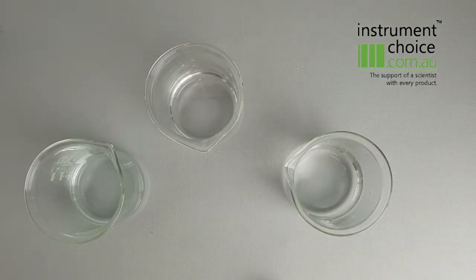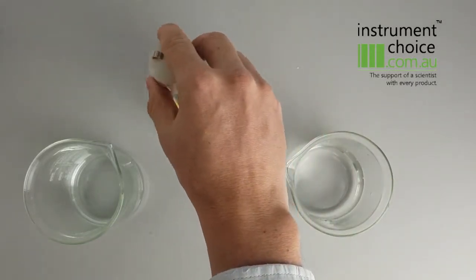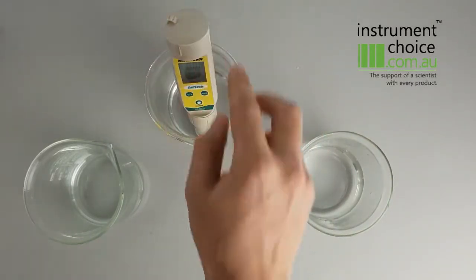Once you've removed it, give it a good shake off so it's relatively dry. Then give it a good stir with distilled water, which is what we've got in this middle beaker.